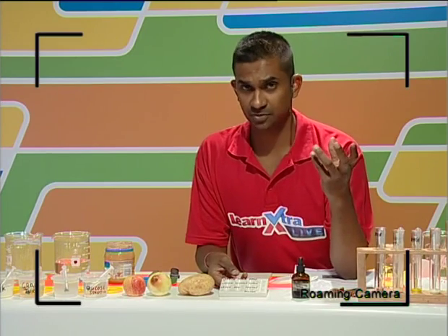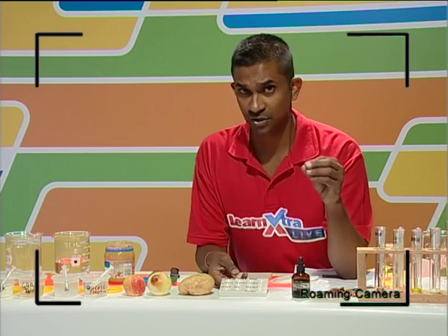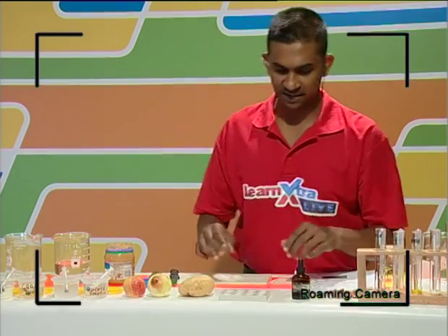Then we would not be able to compare. That's essentially important when you're doing any experiment, to have a control so that the experiment is fair and your results are reliable and accurate. So I'm not going to do any more talking. Let's get busy. That's what the practical is about.